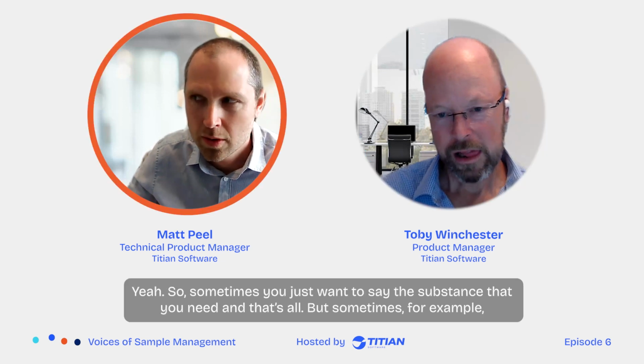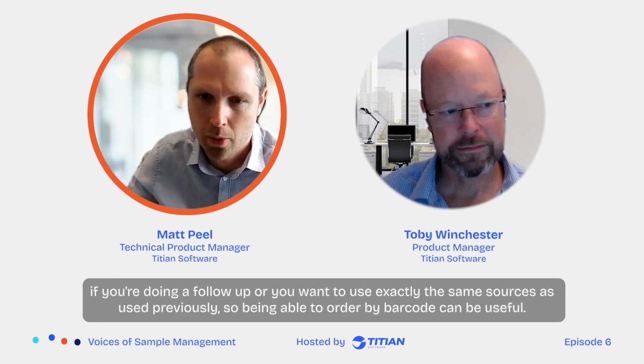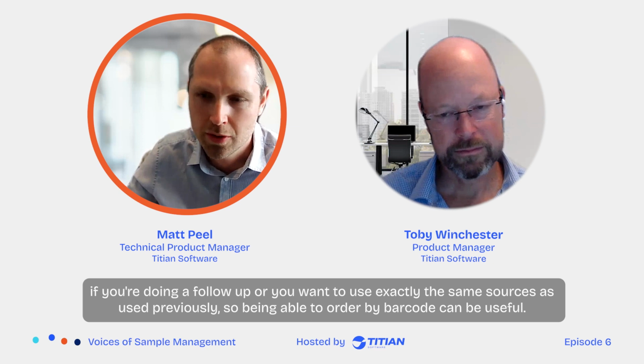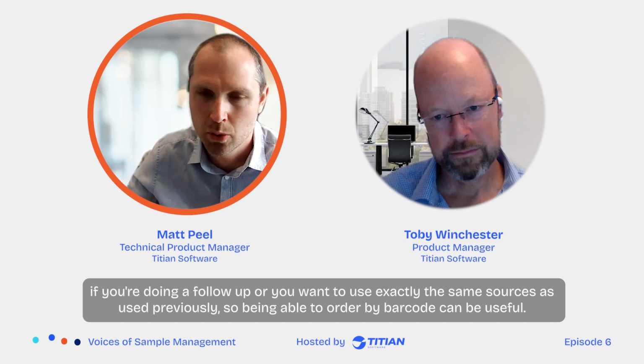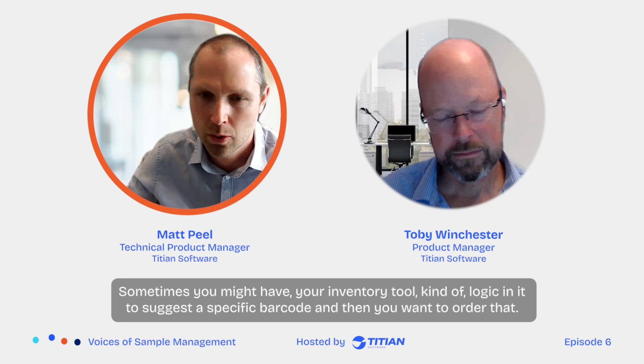Yeah. So sometimes you just want to say the substance that you need, and that's all. But sometimes, for example, if you're doing a follow-up, or you want to use exactly the same source as used previously. So being able to order by barcode can be useful. Or sometimes your inventory tool can have logic in it to suggest a specific barcode, and then you want to order that.